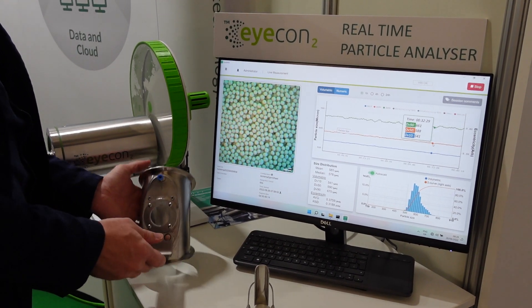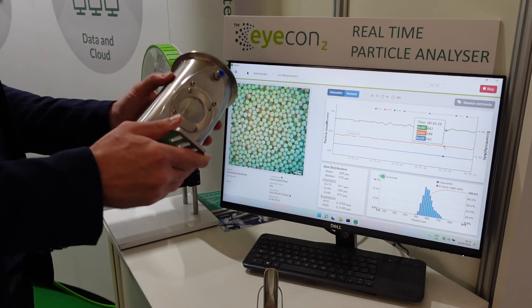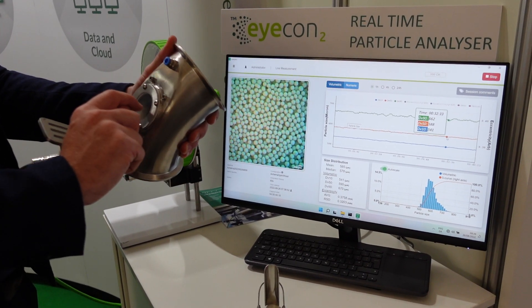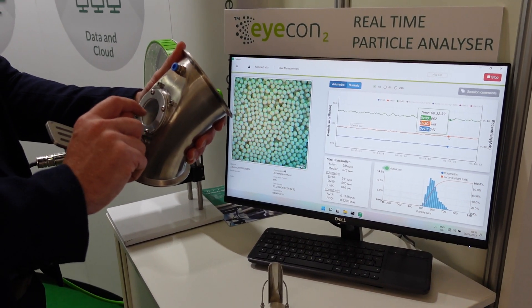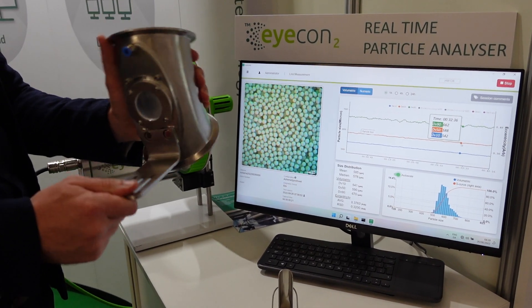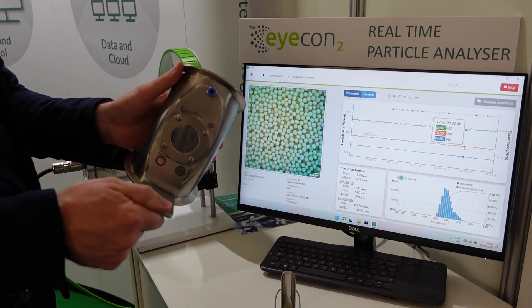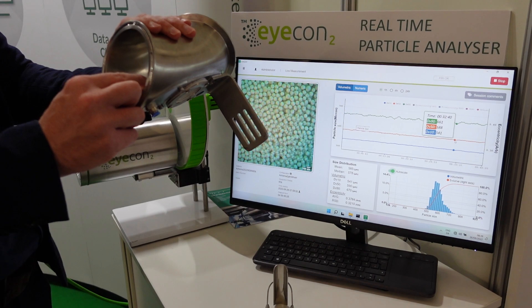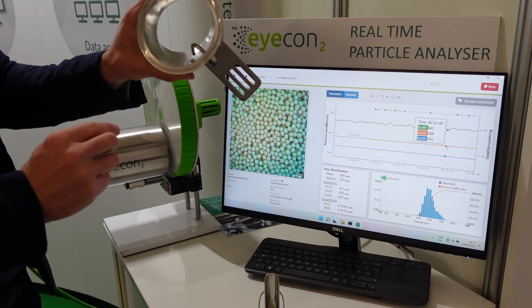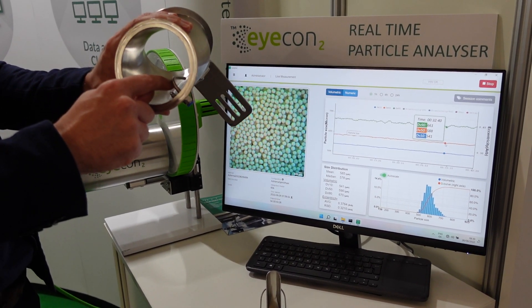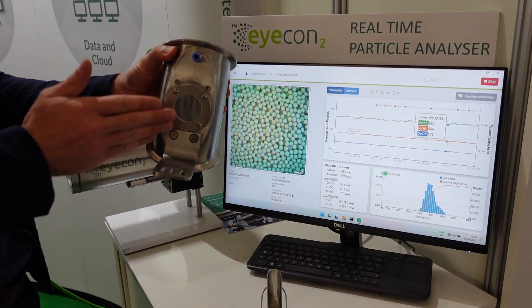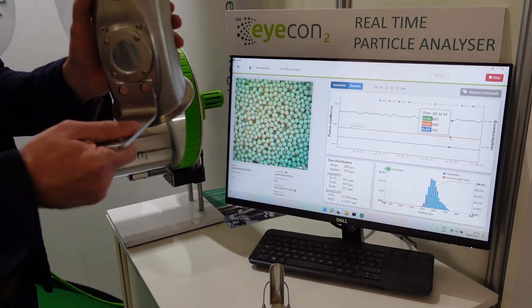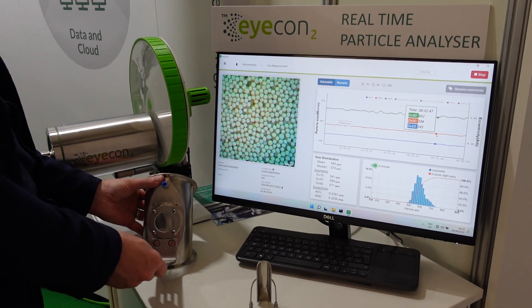One of the hardware pieces I have over here is one of our integrations. This shows a window that the Icon can measure through — that's typically what we do to measure materials in a non-product contact fashion. You mount the unit here, and we also have fouling control solutions for certain processes that might block the windows for measurement. We offer these off-the-shelf solutions as well.